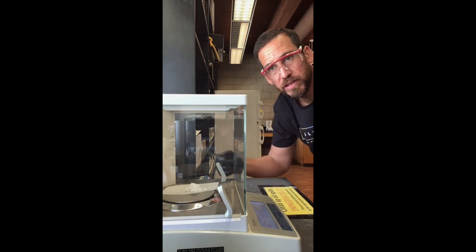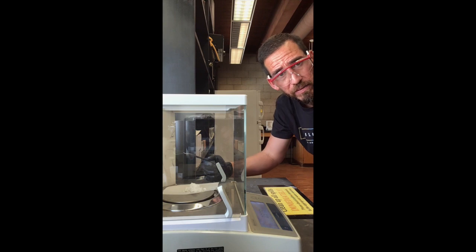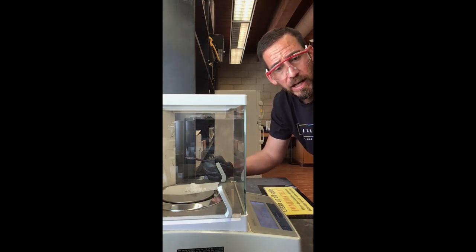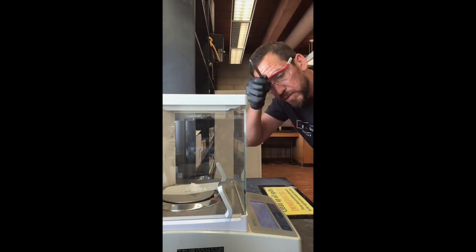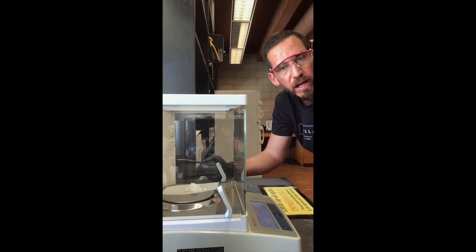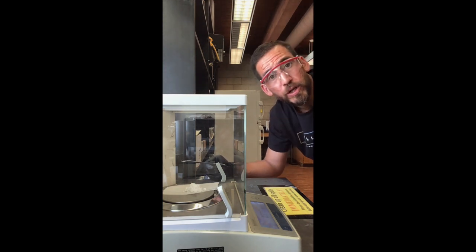Any subsequent recrystallization is going to obviously yield less material, because we have 373 milligrams of it right here, and so there's only about 130 milligrams scattered throughout the different vessels that we've transferred it to. And so crystallizing 100 milligrams requires less ethanol to recrystallize, and it's just going to yield maybe 50 milligrams out of it, and so sometimes it's worth it, sometimes it's not. It just depends on the material that you're working with and your goal.